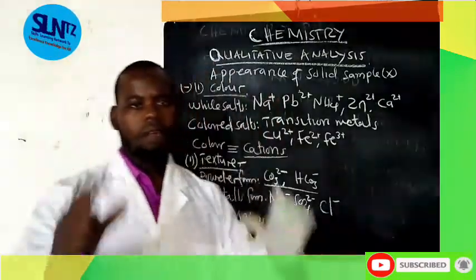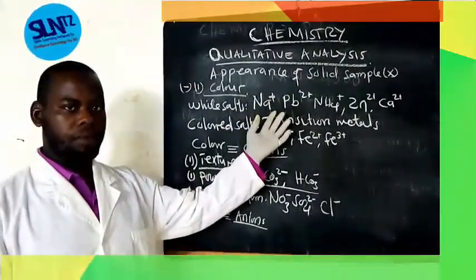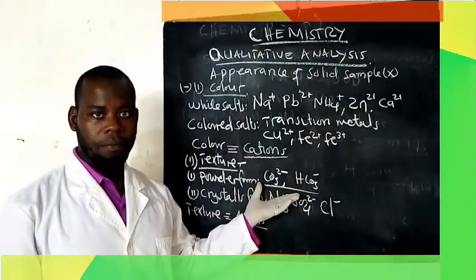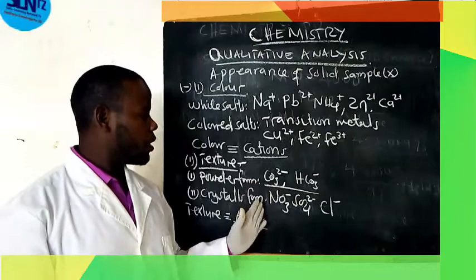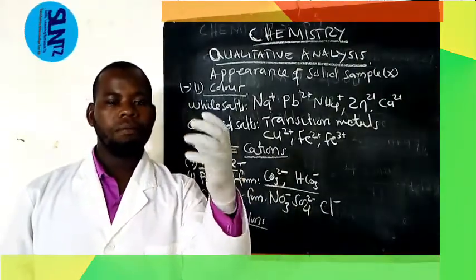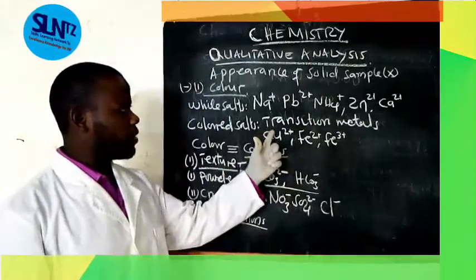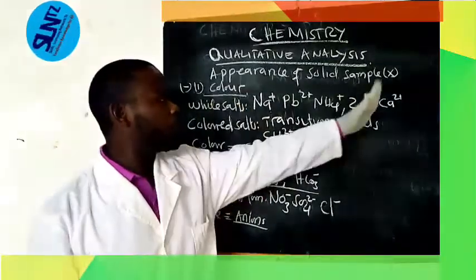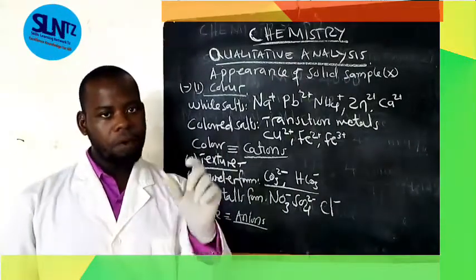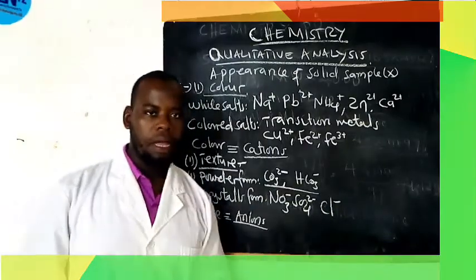Because this is white, but my sample is blue, and my confirmation showing lead is not correct. So you have to have a reference. When you go to another step, you come back to your appearance. And when you get a powder sample, you have to ignore those for crystals. Let's say I've got the blue powder. Blue is the copper. So I'm going to ignore white, and I have powder, so I will ignore these which are crystals. So can I get carbonate or bicarbonate?